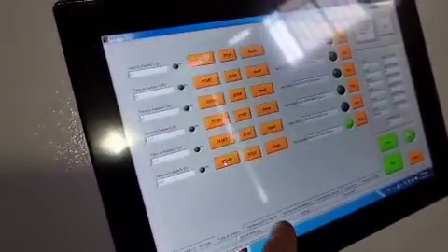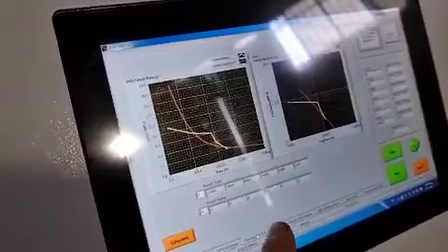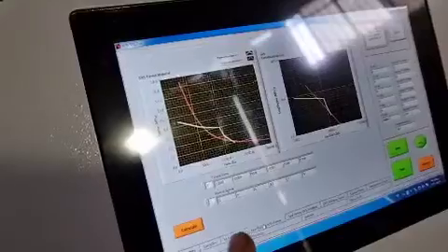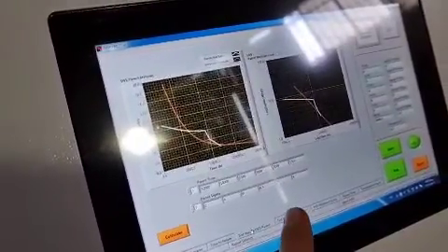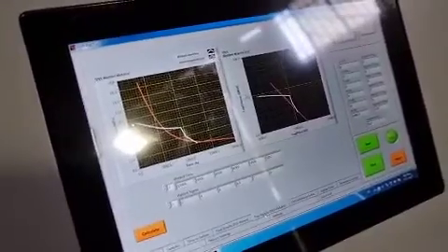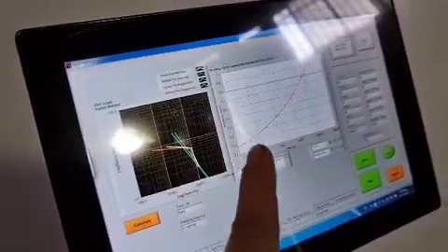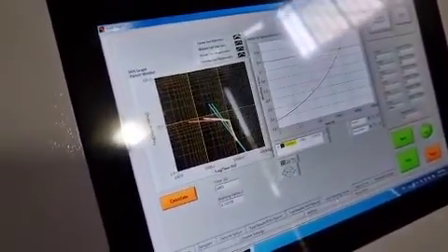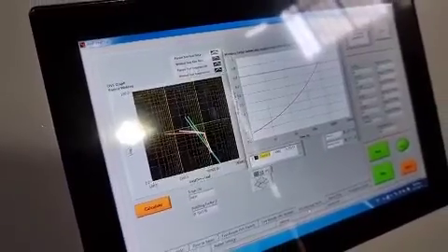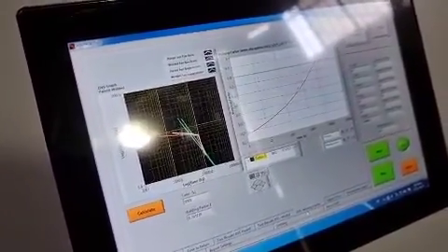After completing all the tests for parent material samples and welded samples, you come to the test results calculation page. Here it will calculate the regression graphs for the parent material, and on the next page it calculates for the welded samples. If you click Calculate, it will calculate the welding factor according to the results obtained from six samples across six stations.